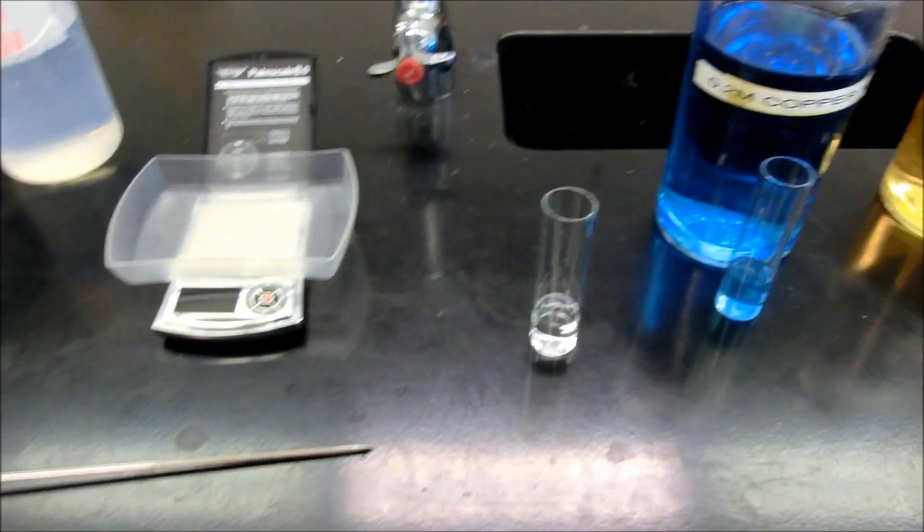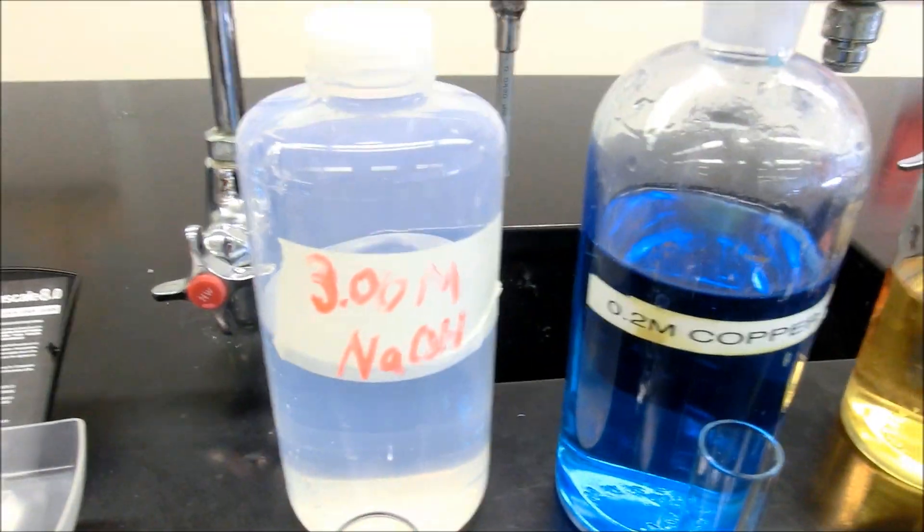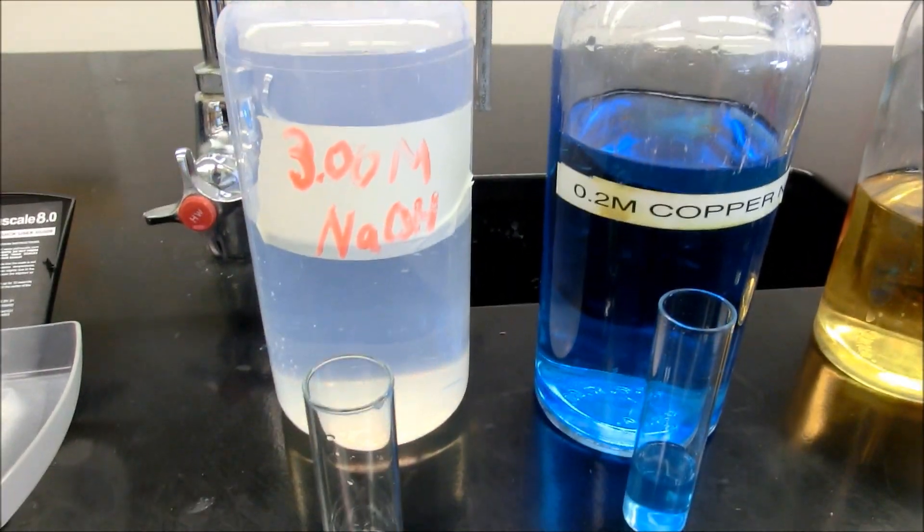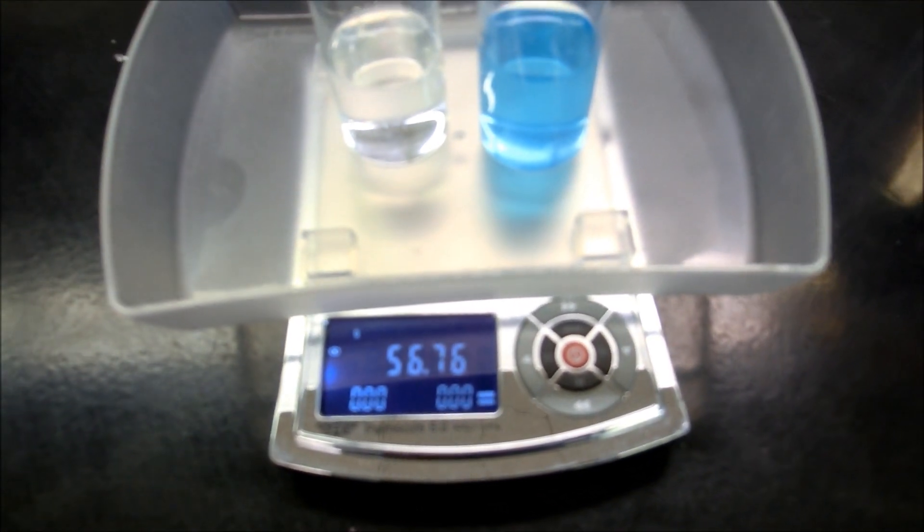Alright, for reaction number two, we have copper nitrate and we again are using sodium hydroxide. So let's go ahead and weigh those before we start. And the weight of those two together is 56.76 grams.